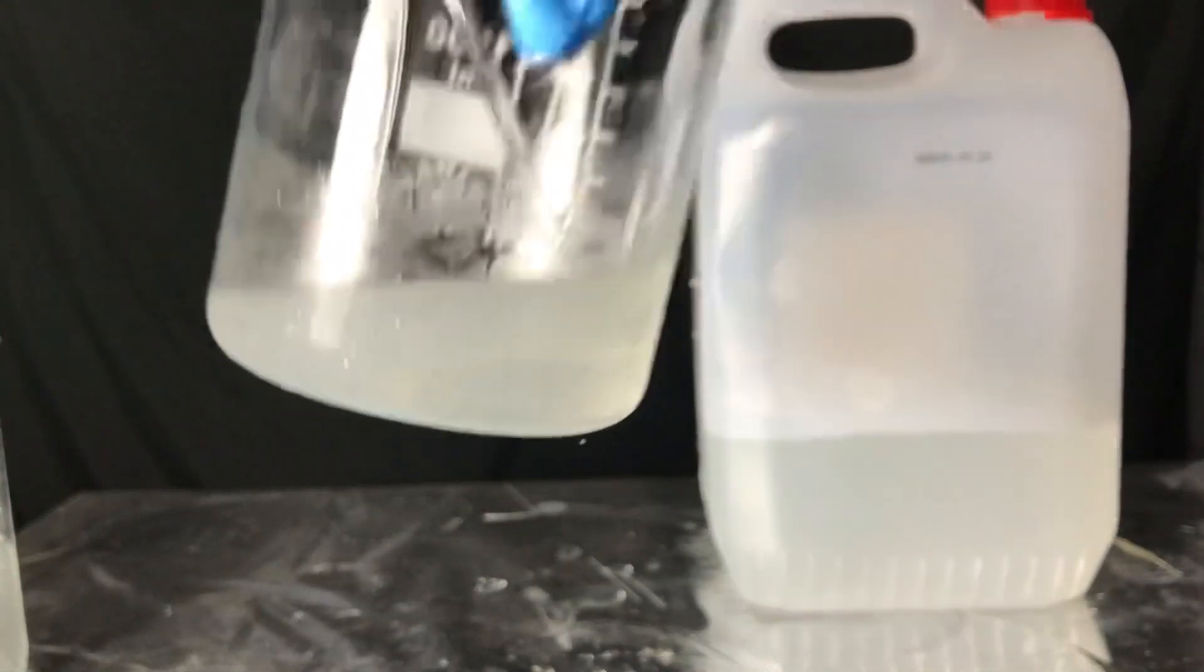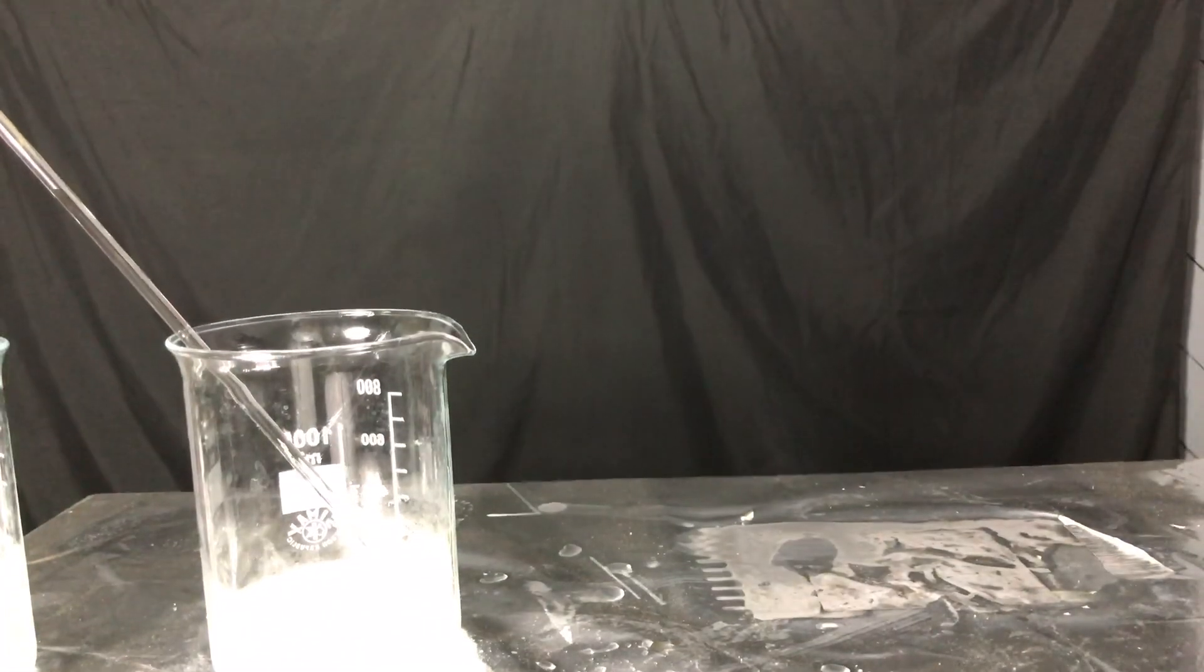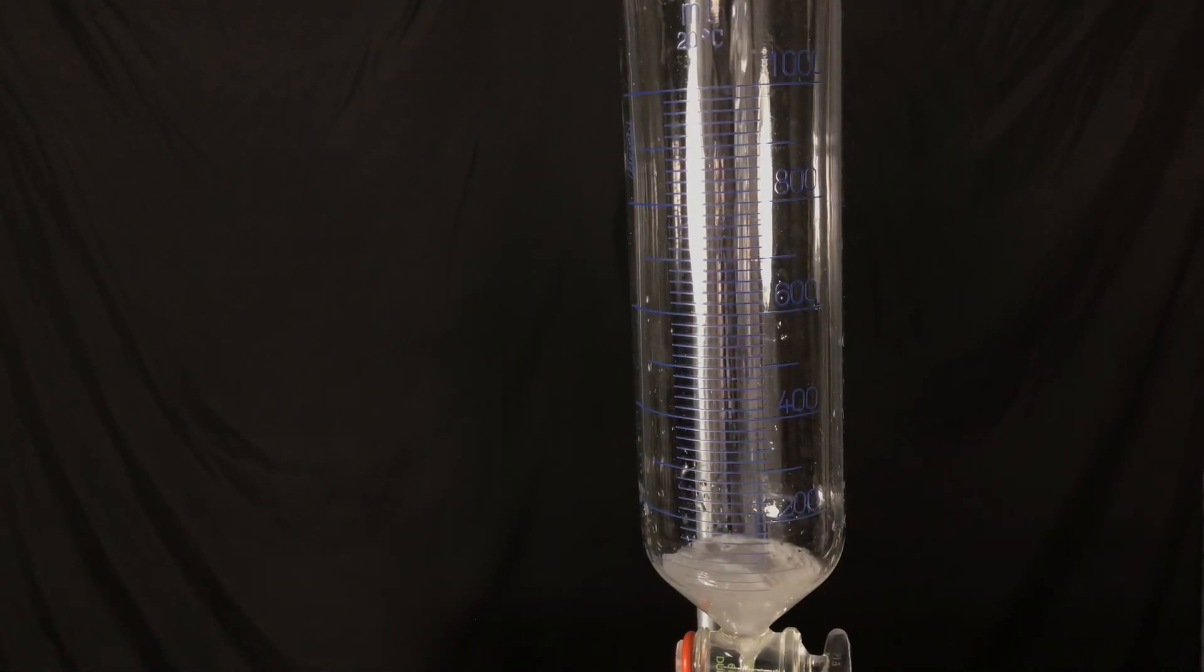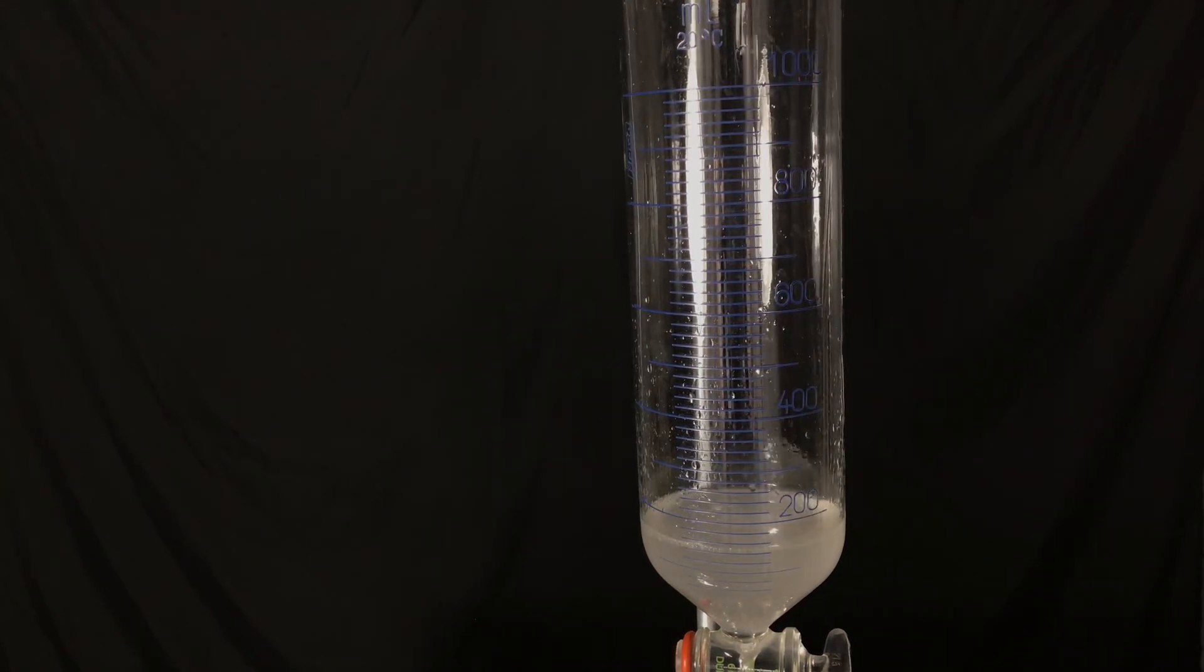After combining both of the beakers, the blobs became even bigger. To get rid of the top layer of water, everything was poured into a separation funnel and the bottom chloroform layer was drained off.